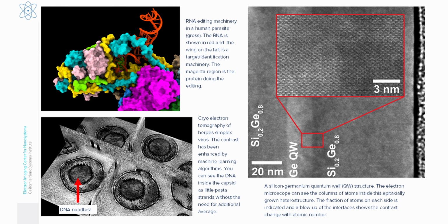When we do tomography, we can actually see inside of these objects in 3 dimensions. These objects can't really form crystals that well, so this is the only technique to look at this at really high resolution. And in the capsid we showed earlier, we had removed all the DNA, but you can actually see inside of this capsid here all these little noodles that are actually the DNA that's trapped inside of that little virus.